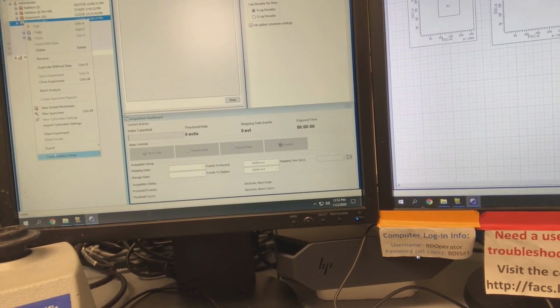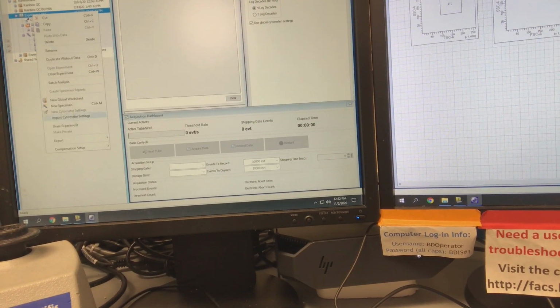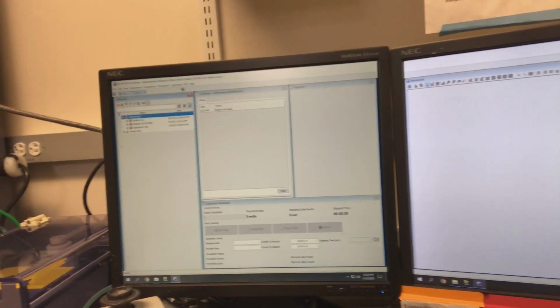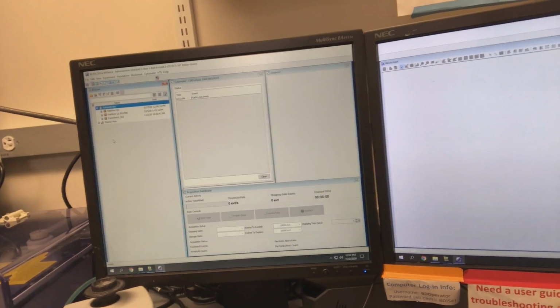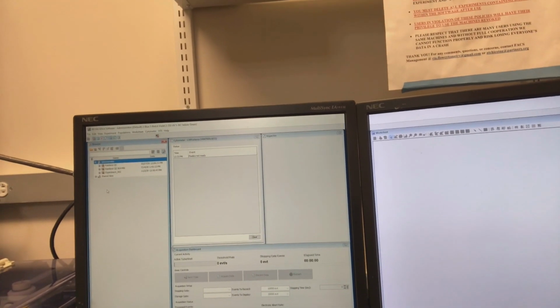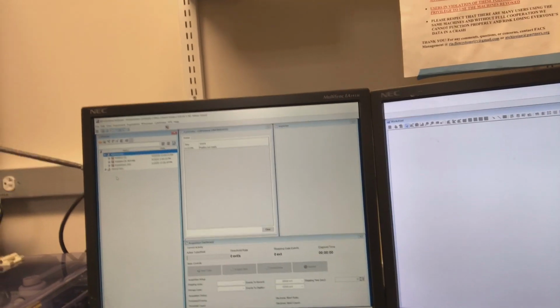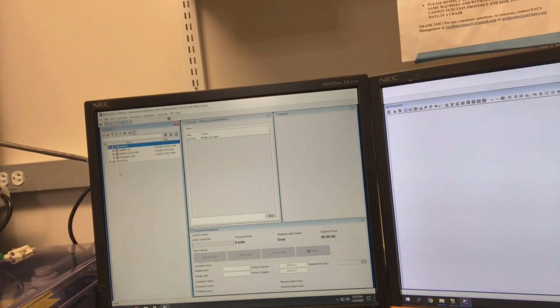Once you've exported your template and your experiment as both experiment and FCS files, please delete your experiment that contains data. It is vitally important that we do this to keep a functioning core, because otherwise the software gets bogged down with over 100 users' experiments and can inevitably crash the system, causing long delays and fixes that are required of BD service technicians. Once you've exported your data, you can access the RIA3 server on your own personal computer by following the directions listed on our website.